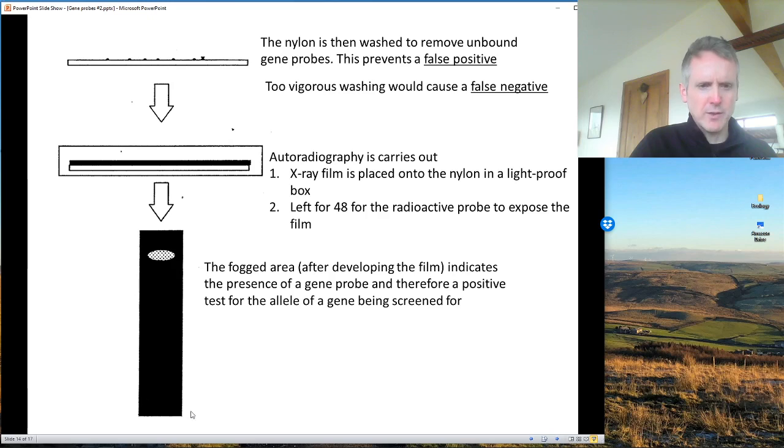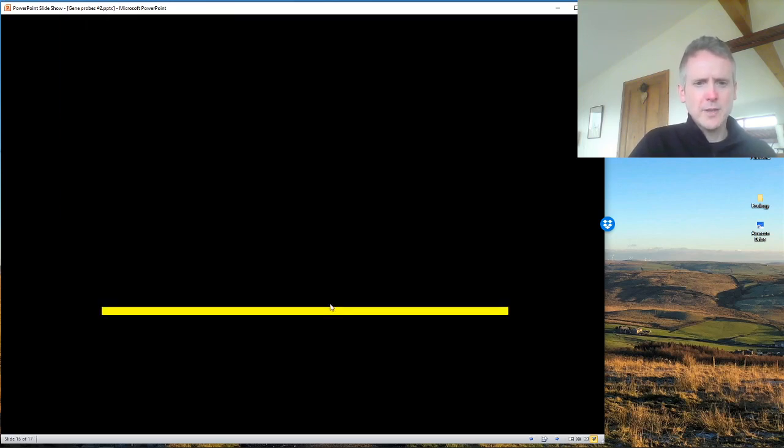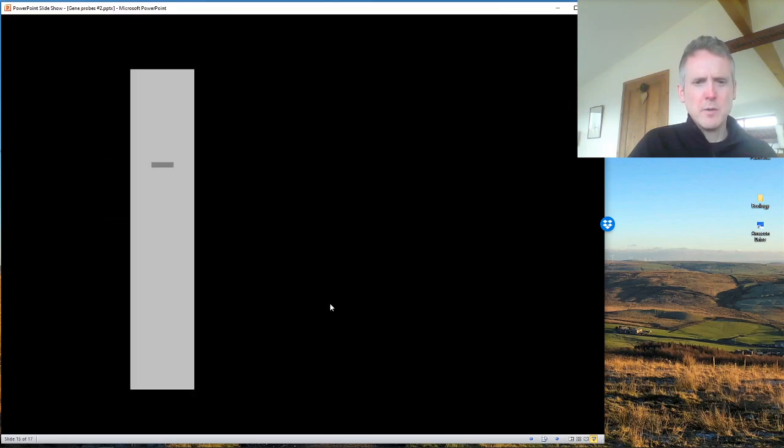So this is our X-ray film. This is a fogged area, and that indicates the presence of a gene probe. And therefore, a positive test for the allele being screened for. So yeah, there's our nylon. Pop on the X-ray film, put it in a box, and that's the result. It's quite a boring result, but there's one blob here, and that blob signifies a defective allele, and therefore this person has got one defective allele.